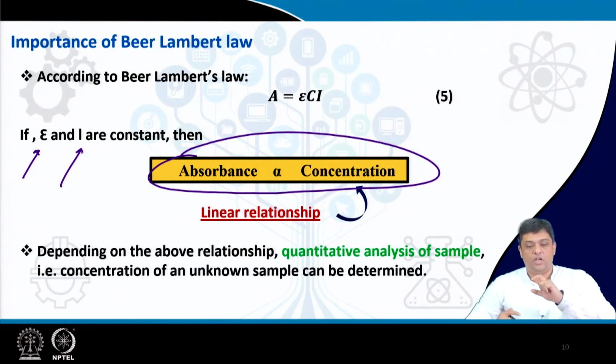You will have a solution with 0 concentration of the absorbing material. You will get an output corresponding to an incident UV visible electromagnetic ray. Then you add C1 concentration, the output will change, and then you can draw the absorbance as a function of increasing concentration, and you will get a curve.